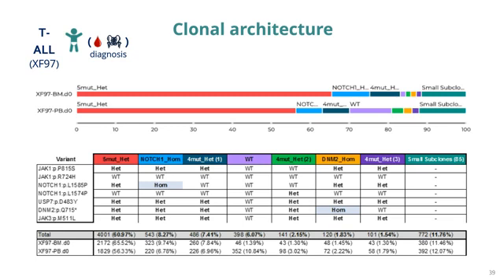And there is 1 clone in light purple that is labeled as wild type, because the cells in this clone are wild type for these 7 variants. So this is the clone that contains the healthy cells. And you can see that it's the only one where the frequency is really different in bone marrow and blood. But this is consistent with the clinical data and also with our single cell RNA sequencing data, in which we observe that the bone marrow has a higher leukemia burden. So leukemic cells are higher in the bone marrow.